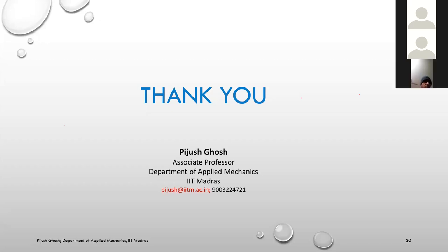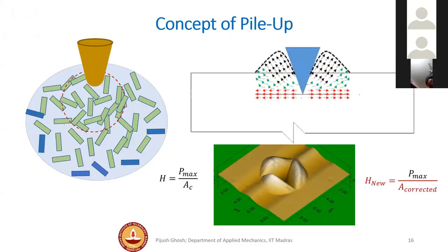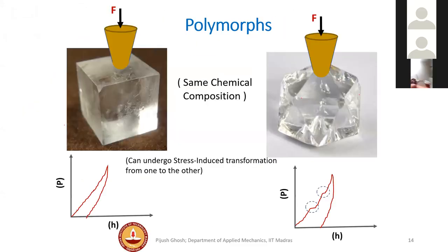Okay, sure. So Amarpreet has two questions. How sensitive is it to the surface? That is the first question. The other thing is, if the crystal is anisotropic and if you have different phases, how do you get very reliable data? That's a very good question, particularly when you are starting as a student.